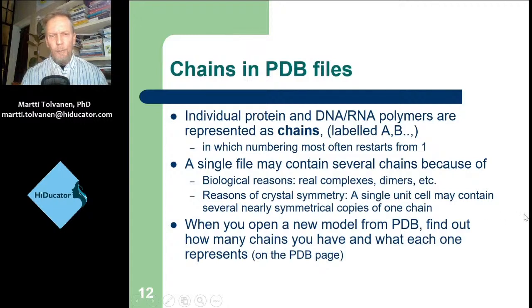And so these crystallographic copies might not actually be binding together, and you might be able to see the difference once you open several such copies: if there is a lot of water between the protein subunits, they are probably just together in the crystal, whereas if there is a very tight interface, it's probably a real dimer.